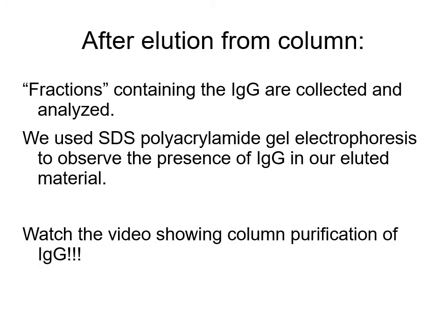So fractions are collected and then analyzed. Okay, there are going to be some videos later that you should watch.